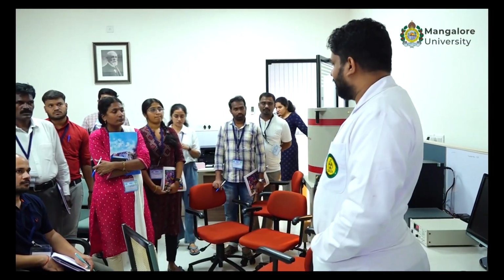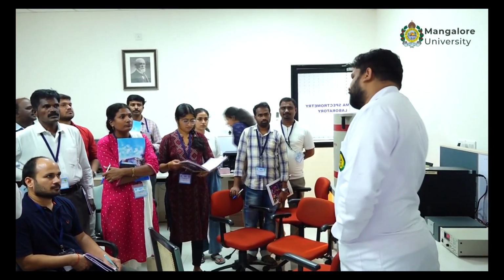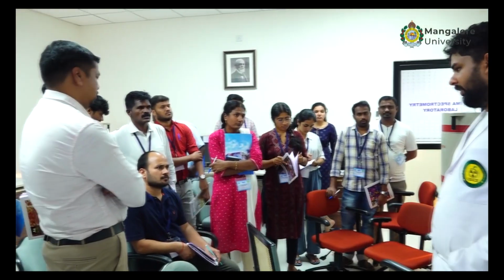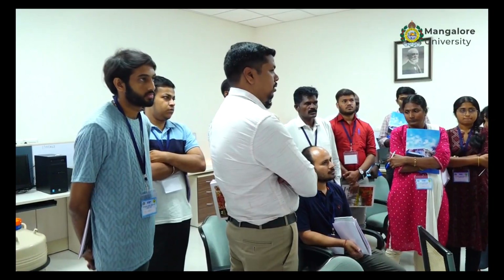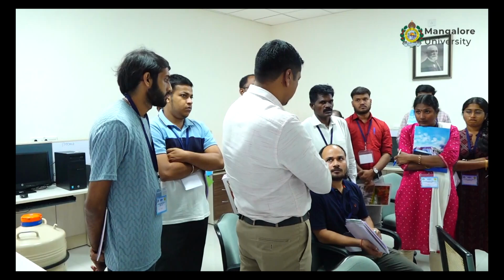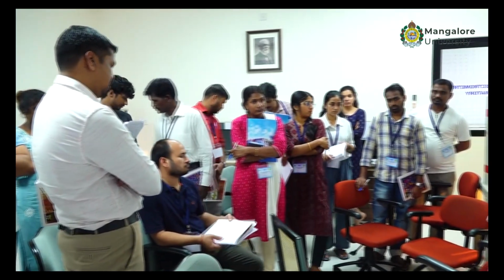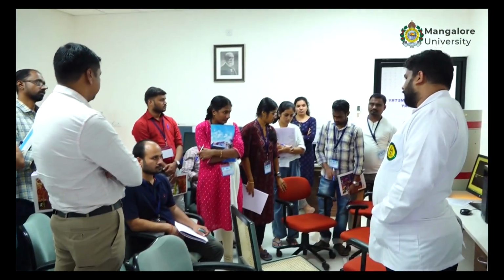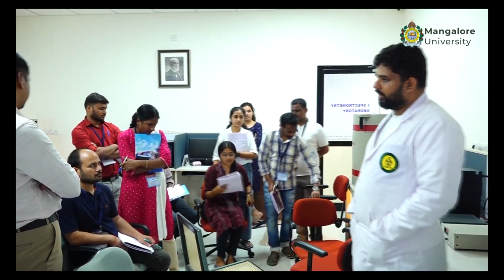So they have taken the activity, all that exercise is done right now, right? Yesterday we saw the spectrum of cesium and cobalt. Cobalt-60 activity was shown in the HPG detector, but we have not seen how the same peaks would look in a sodium iodide detector, right? So initially I will start with the exercise in the sodium iodide detector.